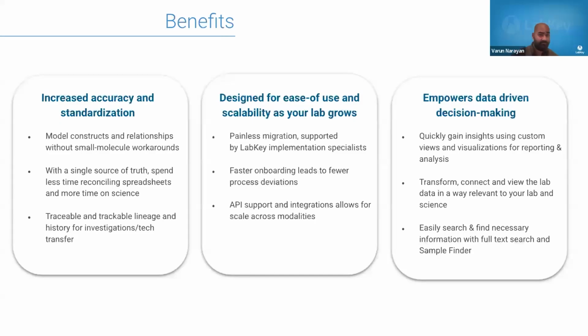And it empowers data-driven decision making. So whether that's through visualizations, searches, or roll-ups, you can quickly find the right data at the right time to answer your most important questions.